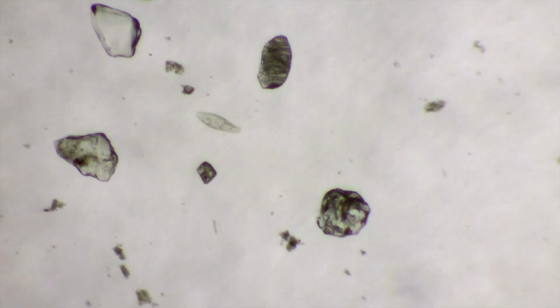These increased nitrates have a significant impact on protist and bacterial colonies. Usually, nitrates in aquatic environments are maintained by the microorganisms inhabiting the sediment. By being exposed to nitrate pollution, it is less likely for the microbiome to recycle decaying organic materials, which can potentially lead to sediment acidification. Knowing this, here are some of the microorganisms I encountered in this sample.